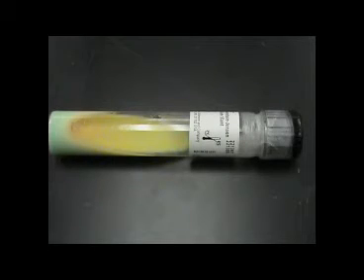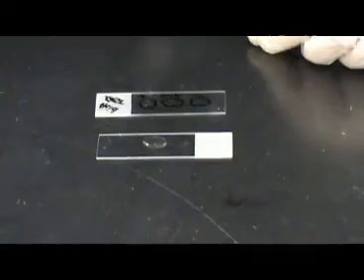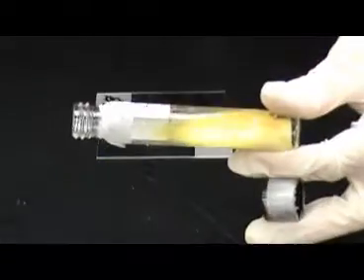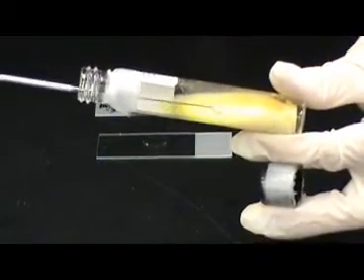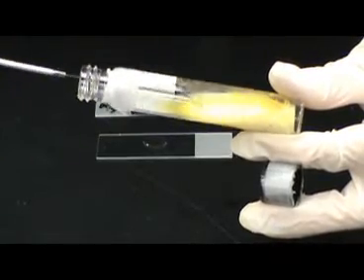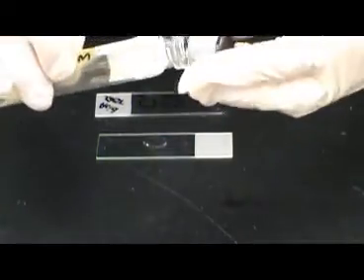We will be using Mycobacterium smegmatis for our positive control. Mycobacterium is grown on Lowenstein-Jensen agar. This is a sterile egg yolk agar. Mycobacterium tends to be very waxy and sticky and can sometimes be a bit difficult to get off of the agar. You may need to use a little bit of pressure with your loop on the agar to obtain enough Mycobacterium for staining.